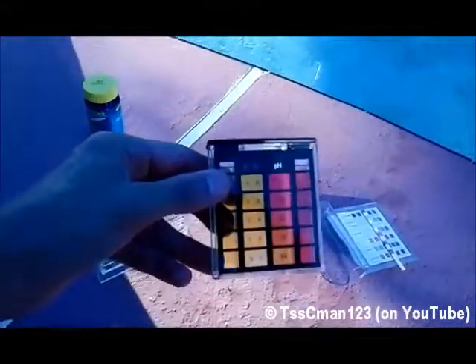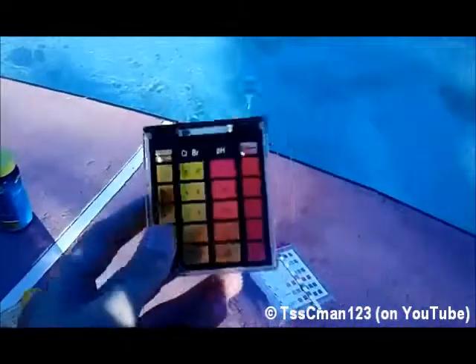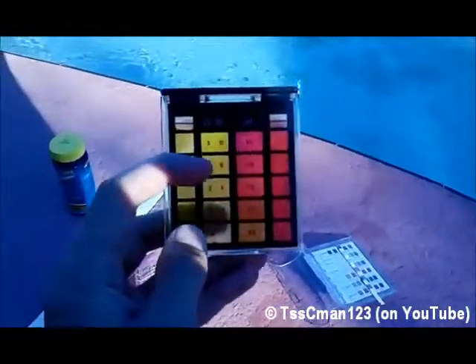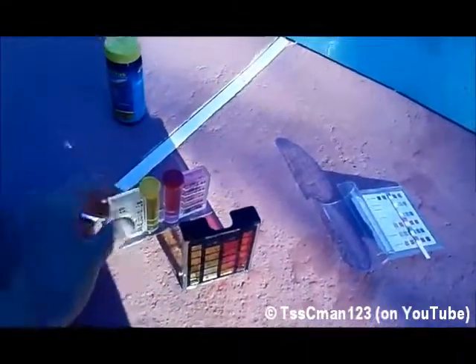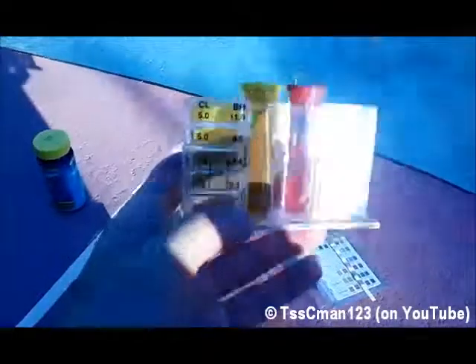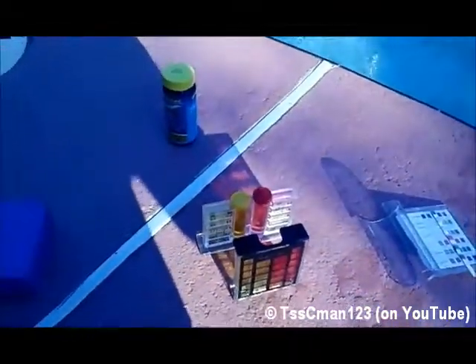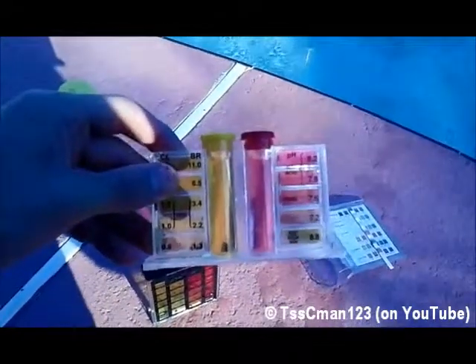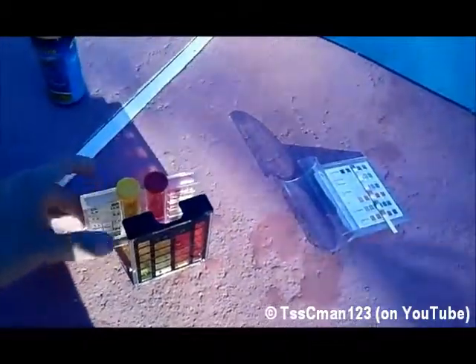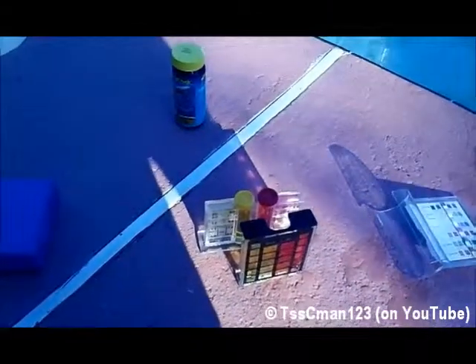Use OTO, because it's the kind with the yellow reagent. The DPD kind is a pink and purple reagent similar to pH, but it can bleach out at high chlorine levels. With OTO, once there's high chlorine levels it just turns a dark yellow and then orange and then brown depending on the chlorine level. So with OTO it at least tells you there's chlorine in there; you can tell around how much, if it's too high or too low. Versus a DPD kind, which I don't have here today.